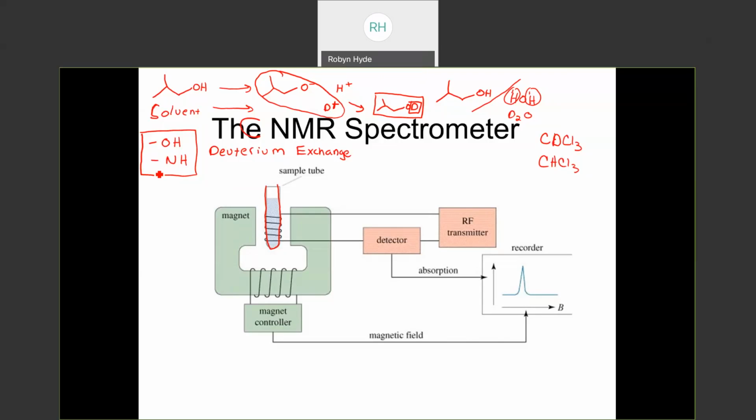But now we have to think about getting the sample out. Here's where we need to be careful, because we're ready to take out the sample. What if we take that air knob and just go whoosh? What's going to happen to the sample? Yeah, it's going to pop up and can fly. We think we have our airflow tuned to where you actually can't shoot the sample too far. But when we turn on the air, you kind of just slowly turn it over. And then the sample comes up and just kind of bobbles.